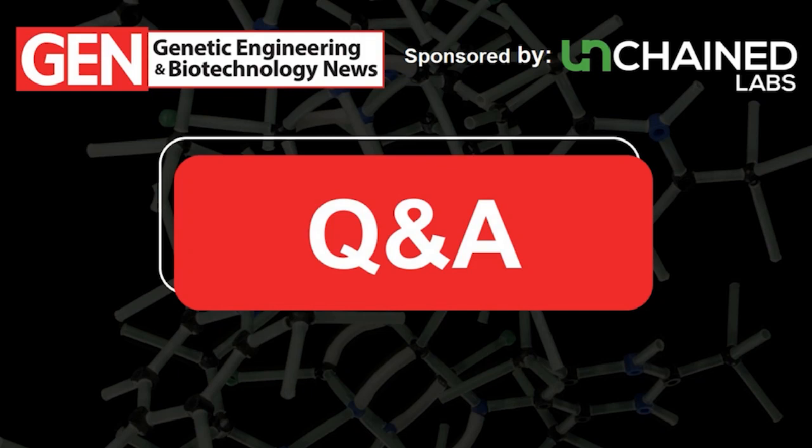All right, thank you, Audrey. Kevin, back to you. Another question. An audience member would like to know, what sample prep do I need to do? Okay, because Stunner's using DLS and light scattering methods and UV-Vis, there's no sample prep that you need to do for downstream methods that are already purified. If you just have your AAV ready to go in your vial, then that's all that Stunner needs to see it. I can see there's a couple other in-process samples questions coming up, so we'll tackle those later.